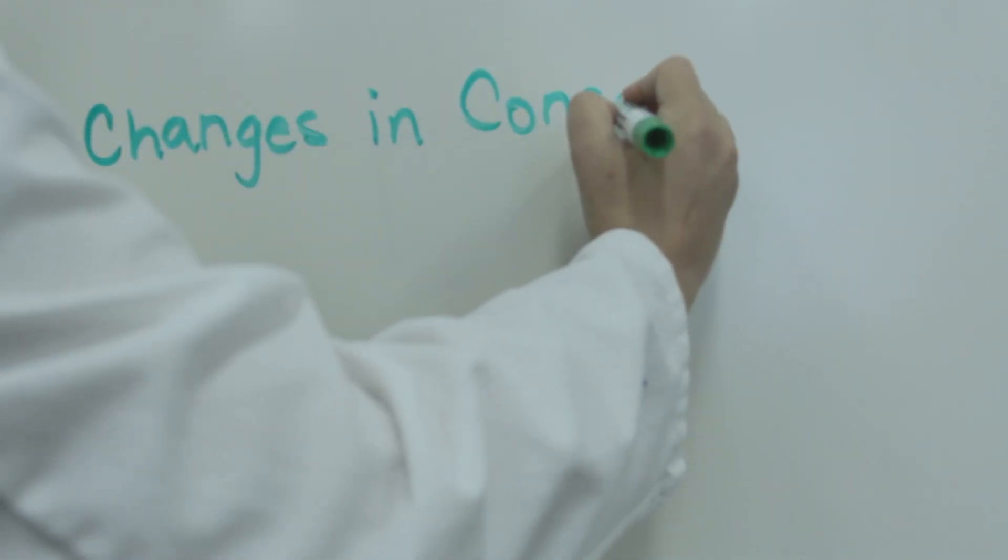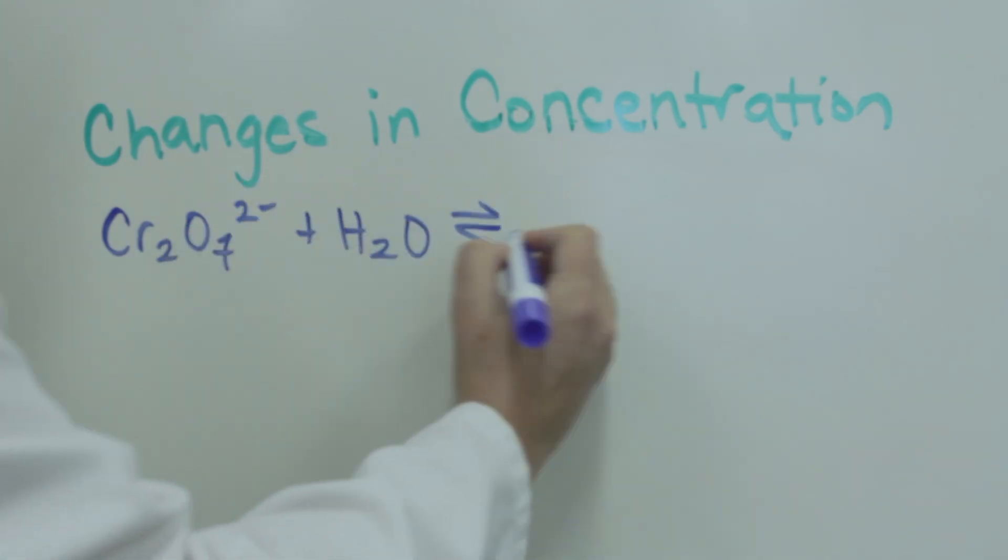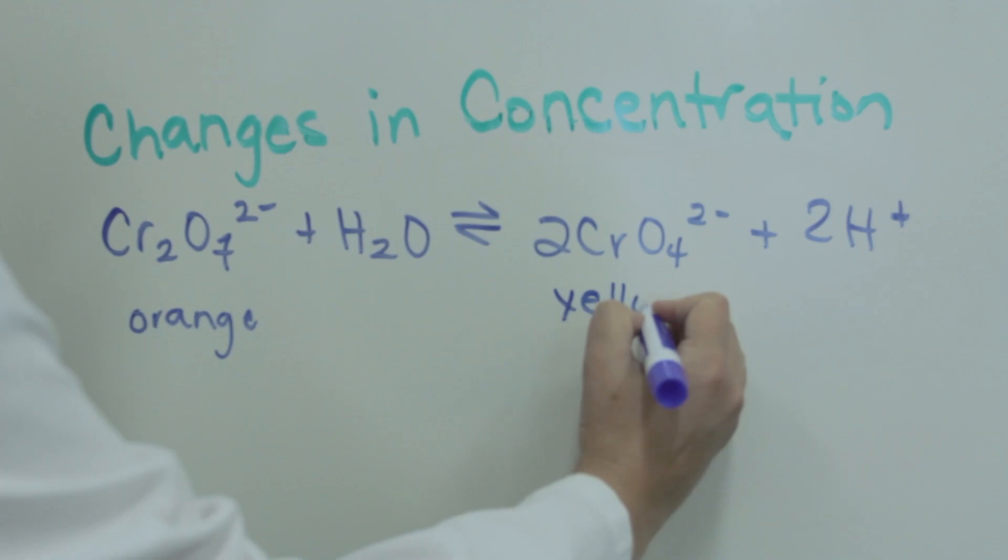First we'll observe the effect of changing the concentration on the equilibrium. The equilibrium that we'll study is one of dichromate in equilibrium with chromate ions. Dichromate is orange in solution while chromate is yellow.